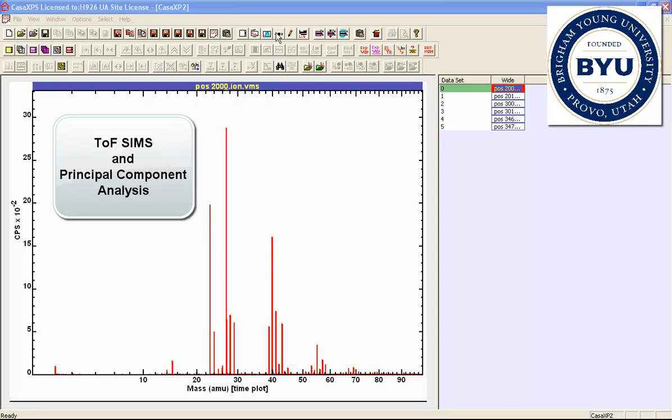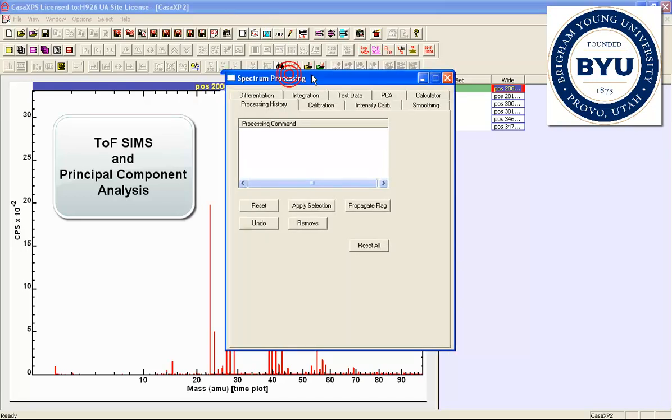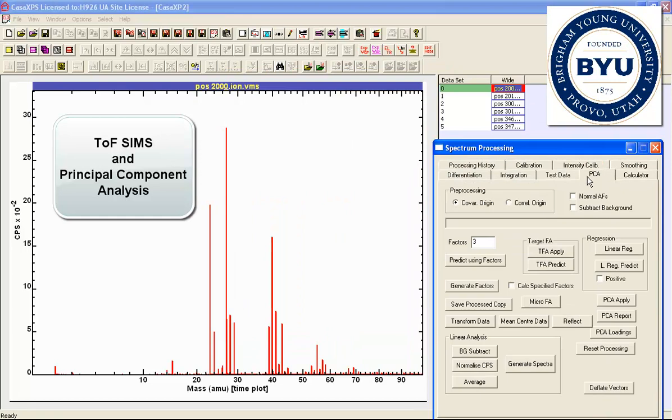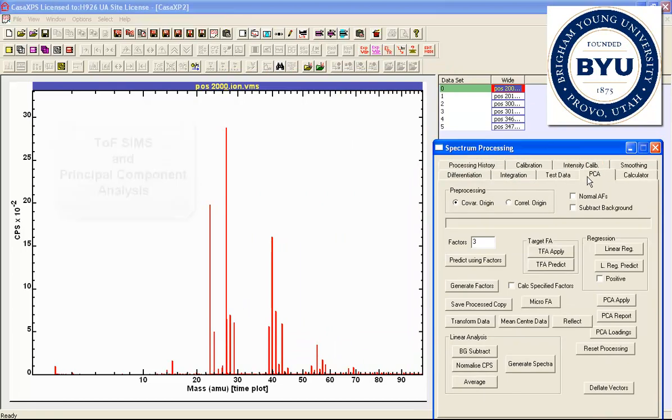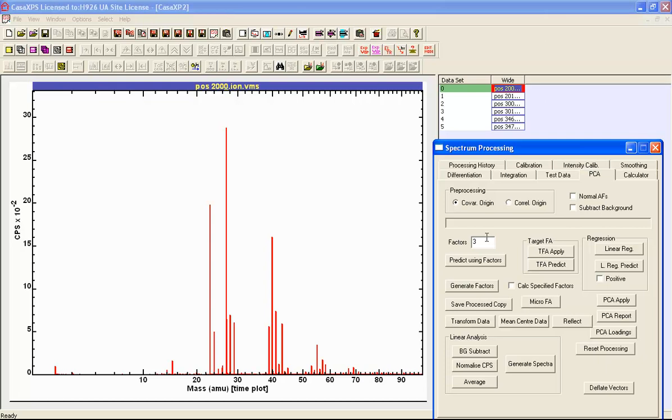In this video we're going to look at the spectrum processing dialog window and the principal component analysis property page. We're going to look at one of the simpler ways of using this property page, and that is to perform a basic principal component analysis of a set of spectra.